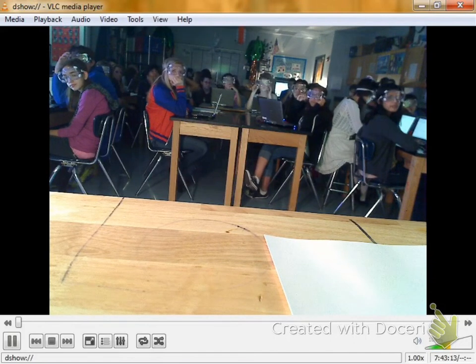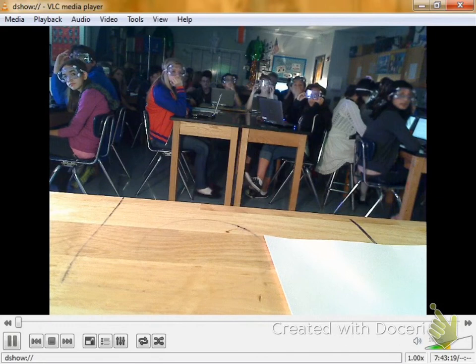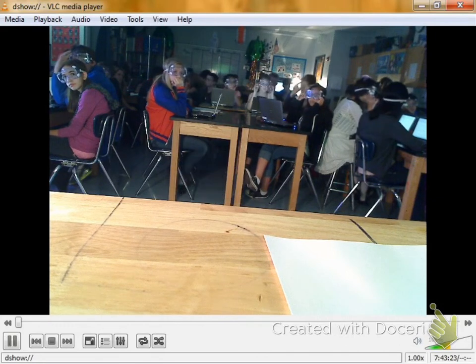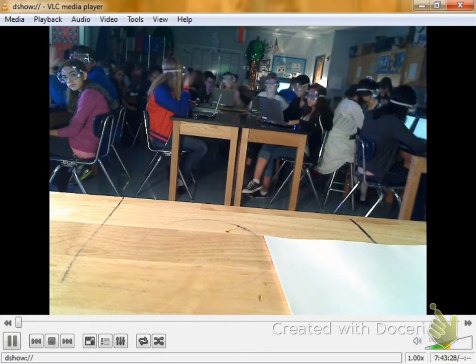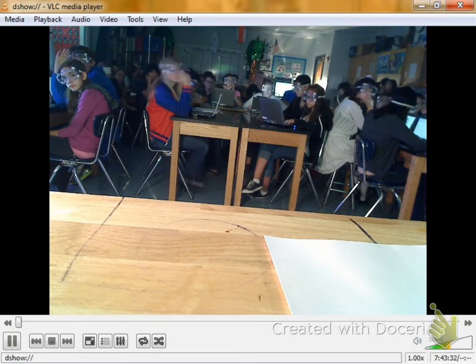The first sodium didn't catch on fire. I put another one in there. It caught on fire and it popped. What's below sodium on the periodic table? Potassium. Yeah, it should be more reactive. Keep in mind, I don't really want to blow up the school.